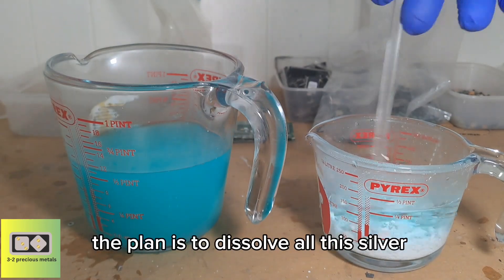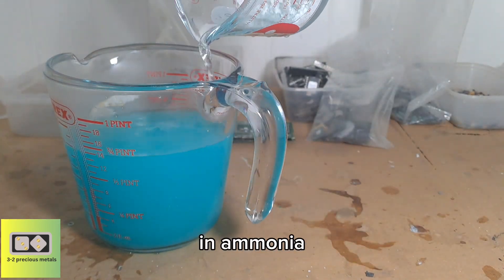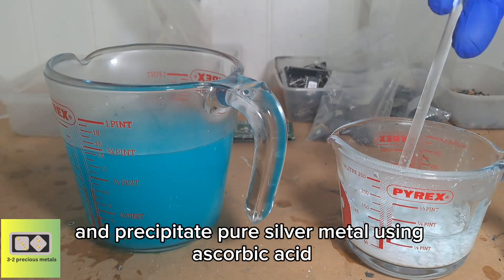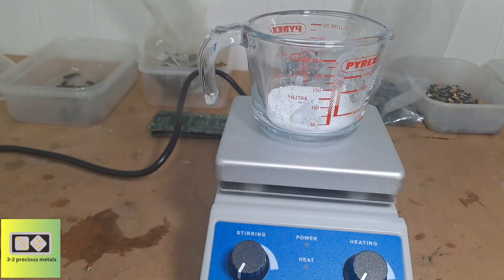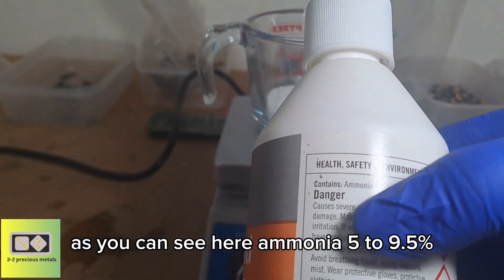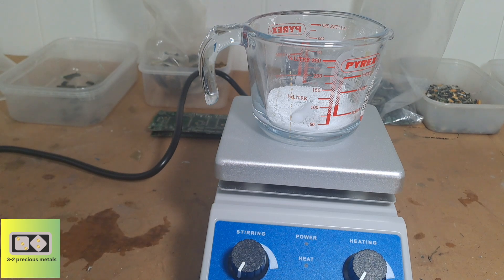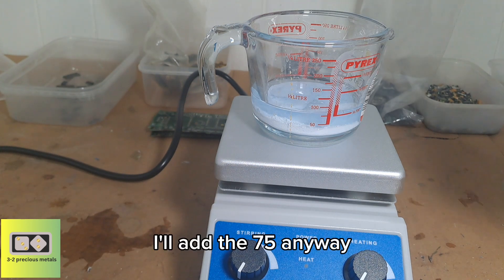As I said before, the plan is to dissolve all this silver chloride in ammonia and precipitate pure silver metal using ascorbic acid — otherwise known as vitamin C. So here I've got some household ammonia, as you can see — ammonia 5 to 9.5 percent. It takes 75ml to dissolve 25 grams of silver chloride. I know there's not 25 grams here, but I'll add the 75ml anyway.